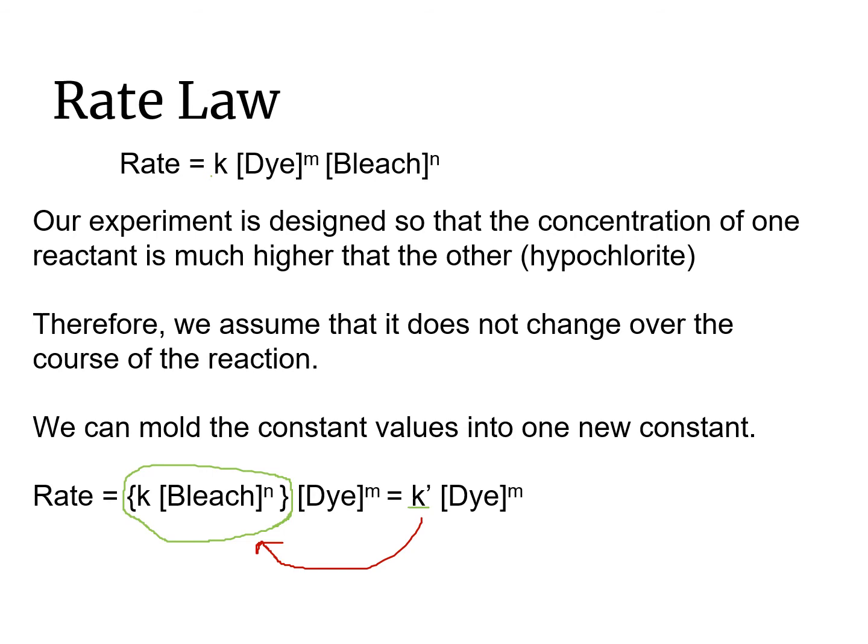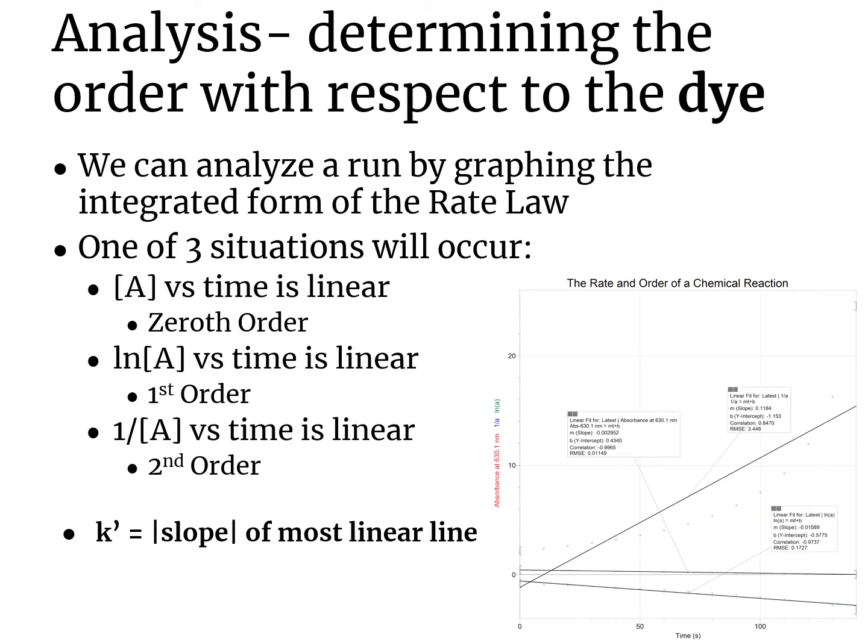But instead of using concentration, we are actually going to replace the concentration variable with absorbance. There is an equation that should relate the concentration of the dye with absorbance, and you need to pay attention to the absorbance value that I will point out at a later slide.